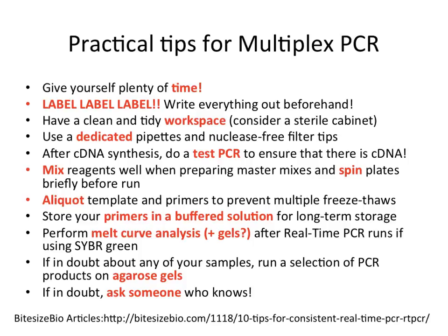Have a clean and tidy workspace. Consider using a sterile cabinet if you are working in a microbiological lab and don't want to risk contamination. Use dedicated pipettes and nuclease-free filter tips.